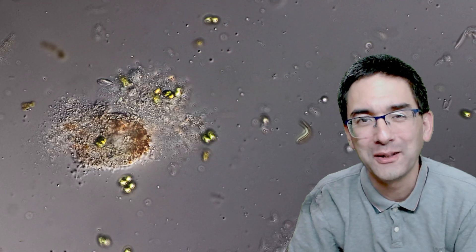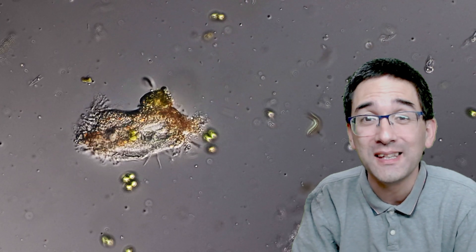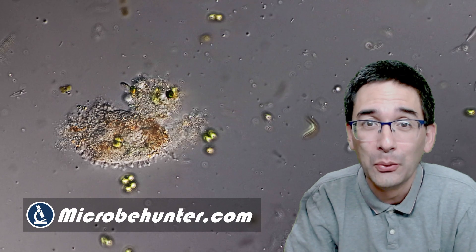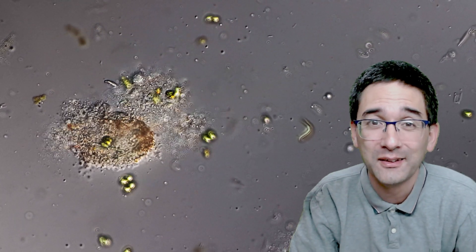Hi, hello, and welcome. Microbe Hunter here. What you see in the back right now is a ciliate, a single-celled microorganism exploding, breaking apart and spilling the cell's contents. Why is it doing that?